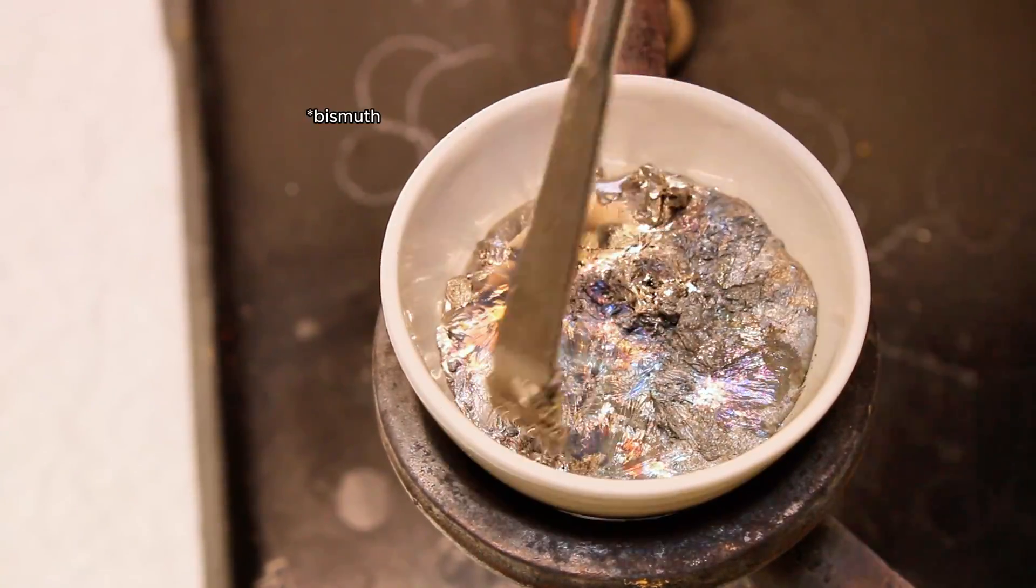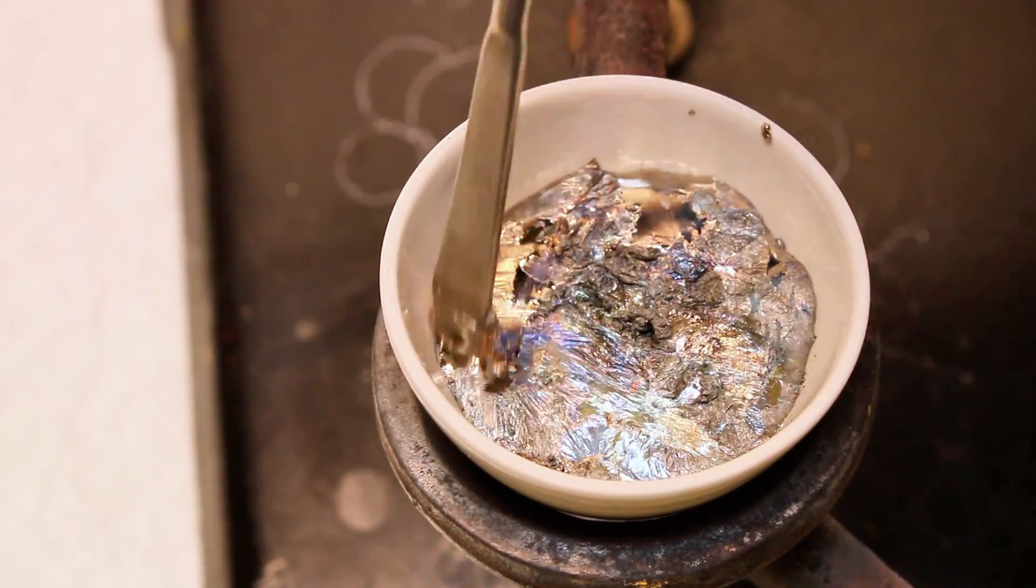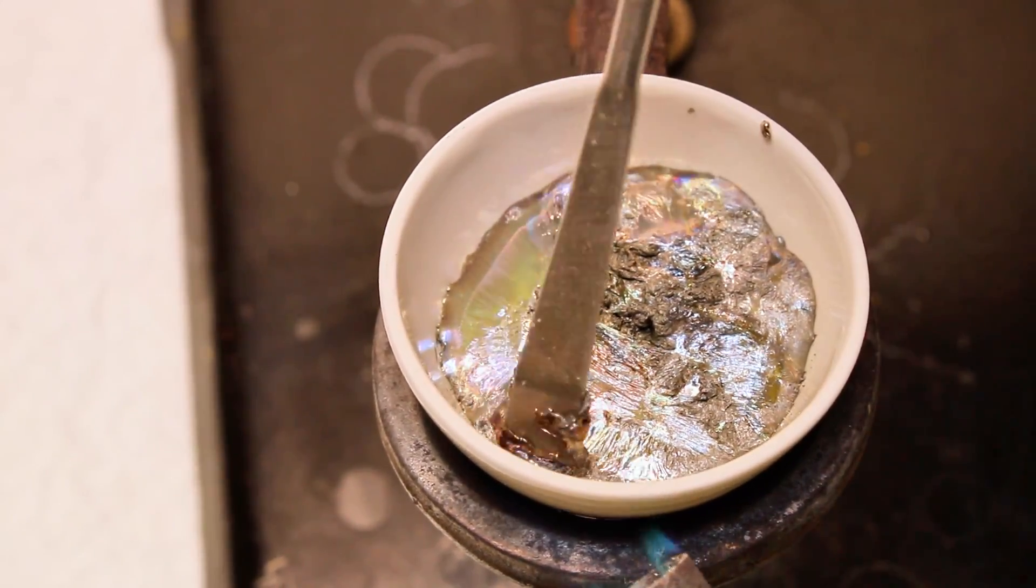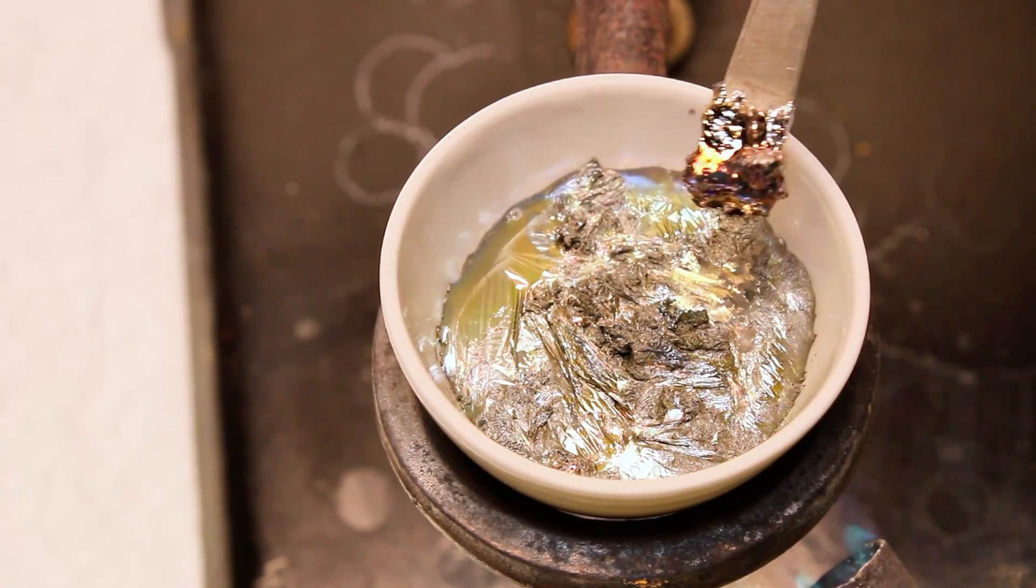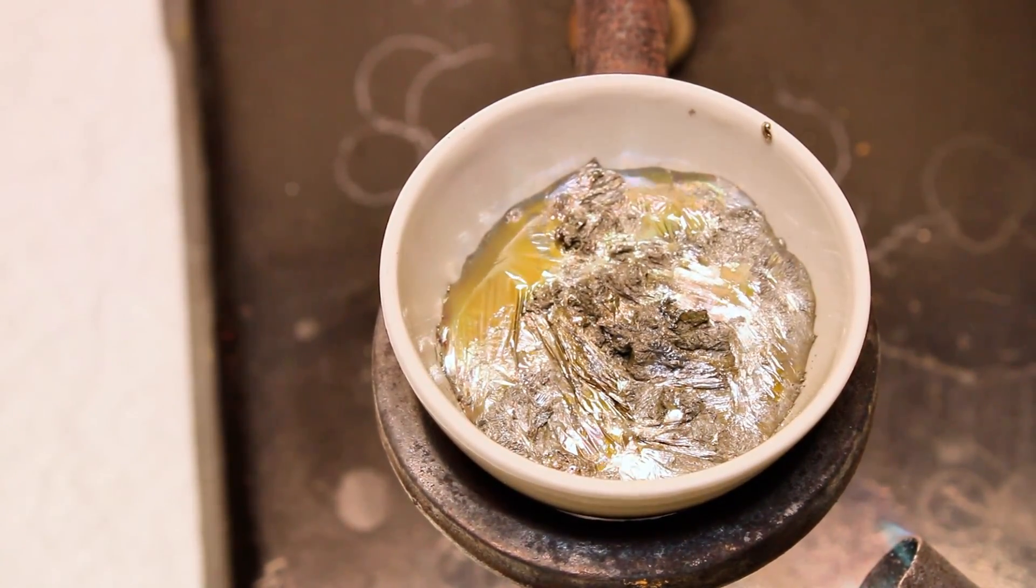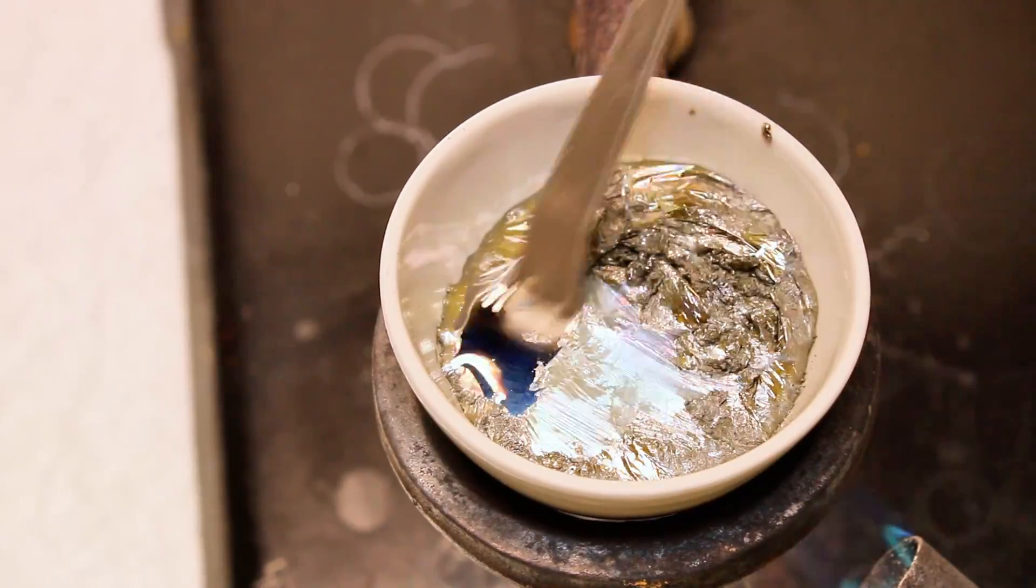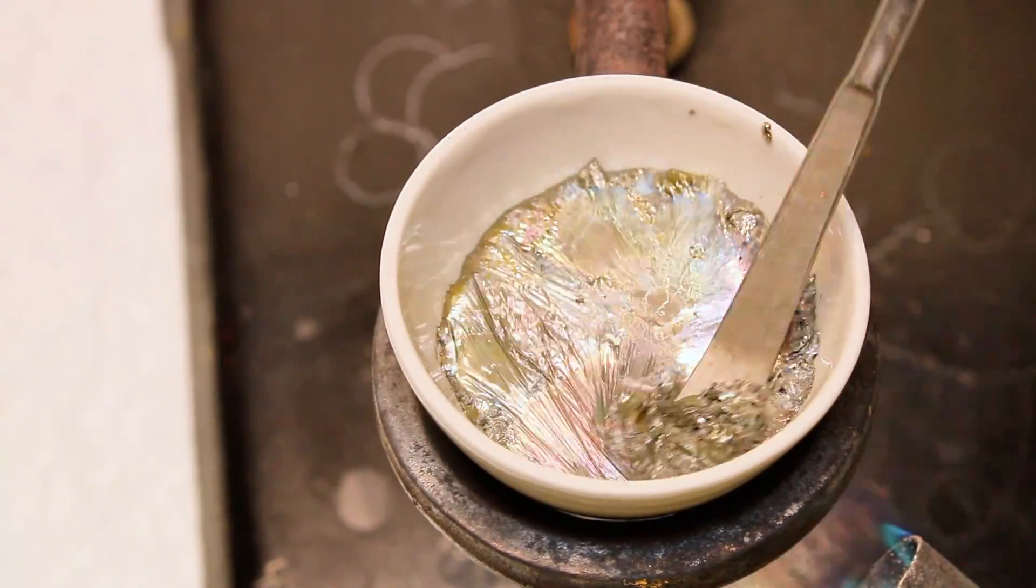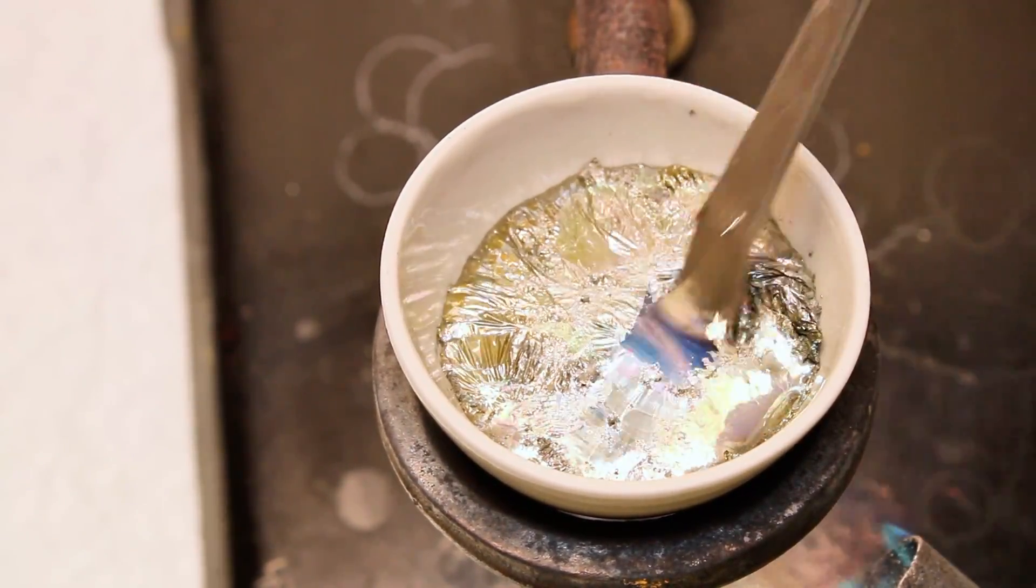Once all the bismuth had liquefied, I scraped the slag off the surface and allowed it to cool down slowly for about five minutes to allow crystals to form. The amount of time you want to wait to allow crystals to form is super variable and really depends on how much bismuth you're crystallizing, as well as the ambient temperature.